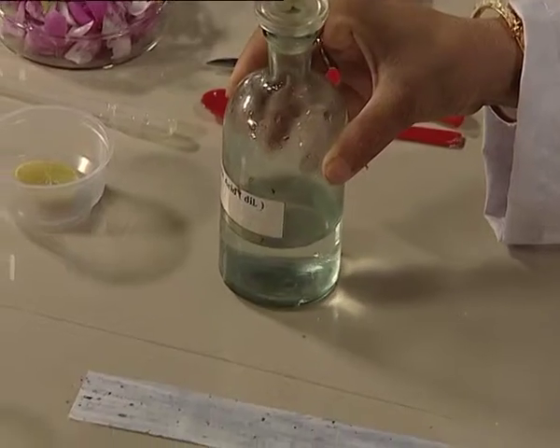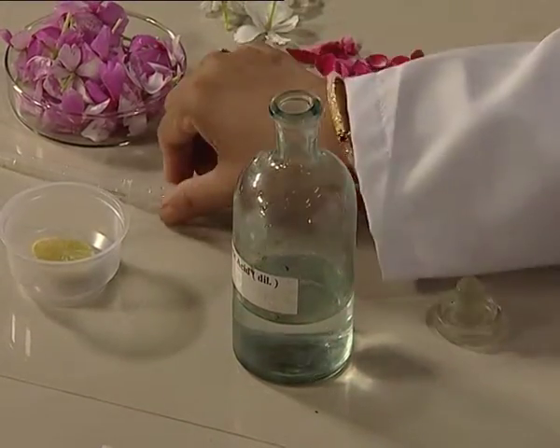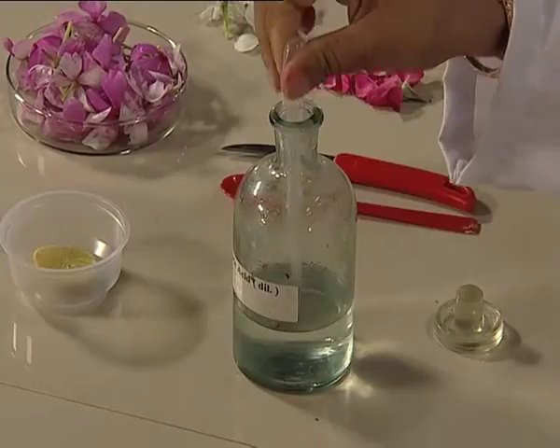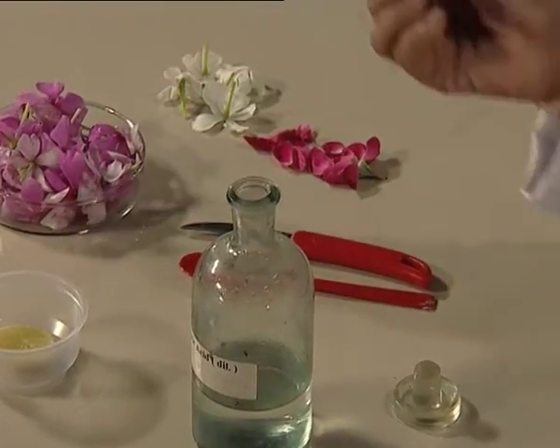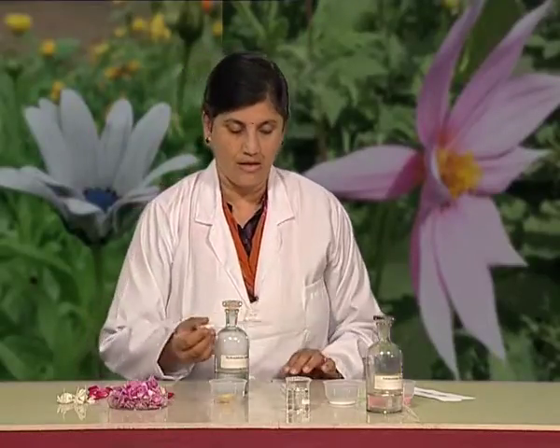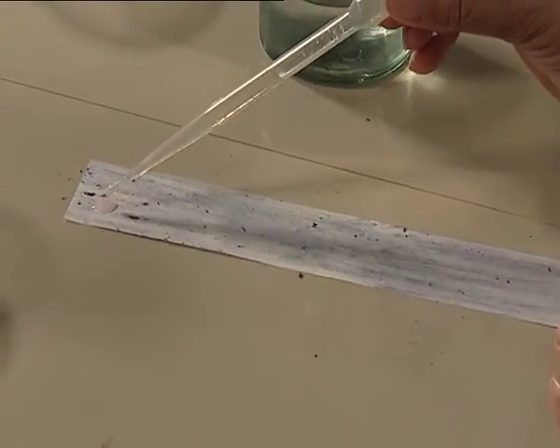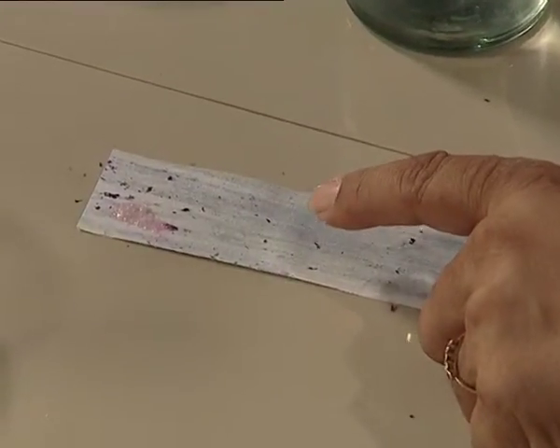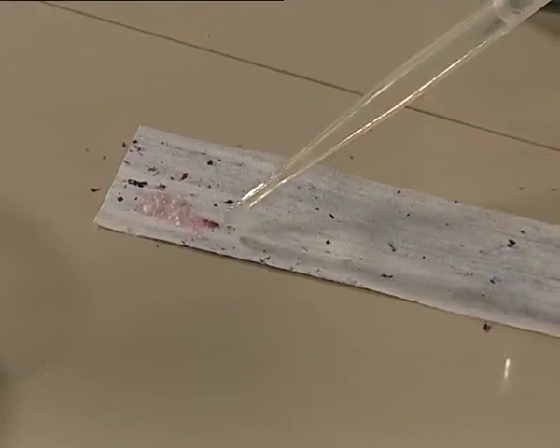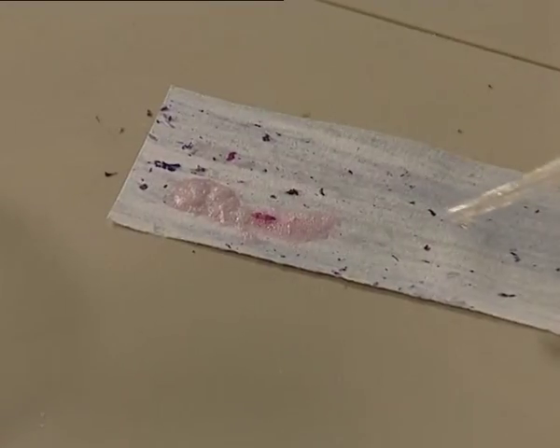Let us place it here. Let us use a dropper to take out a drop of acid. Now I am placing this drop of acid on this coloured paper. Can you see the colour change? The paper was purple — and what colour is it showing now? Right — red.